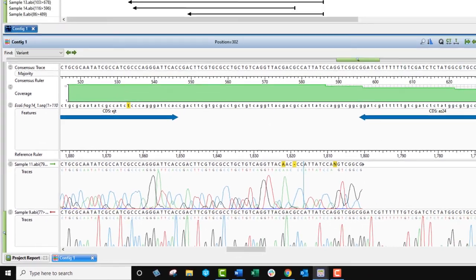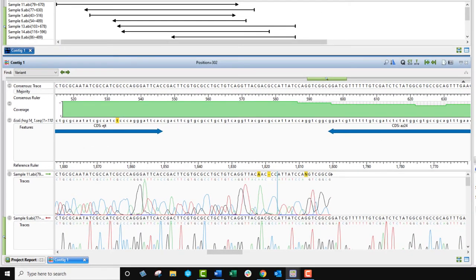By default, disagreements in this view are shown with yellow highlighting. To evaluate quality of the data behind the SNP, you can display quality scores using the cue tool.